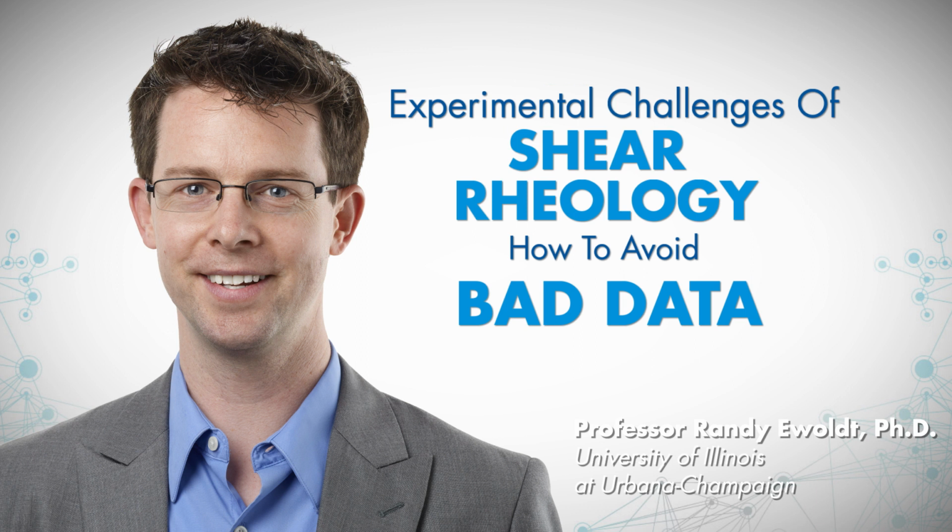Oh, that's a great question. I don't have a very clear suggestion on what that would be, but it would certainly start changing. It depends on whether you're measuring in steady or oscillatory mode. I think the biggest risk would be if you're looking at steady shear data, trying to measure normal stress differences.